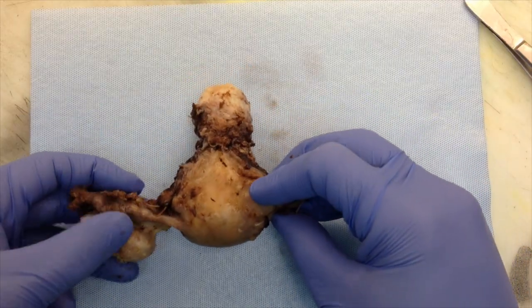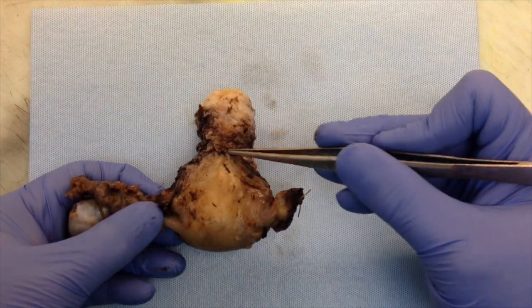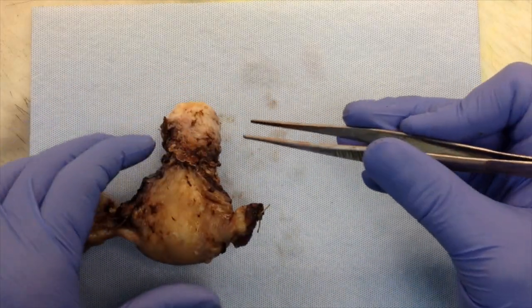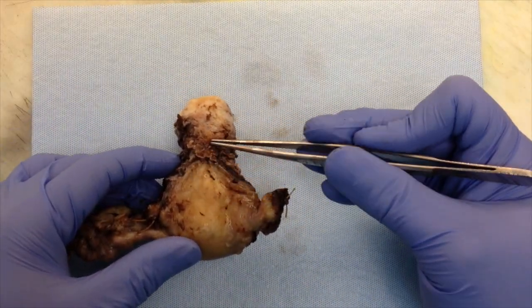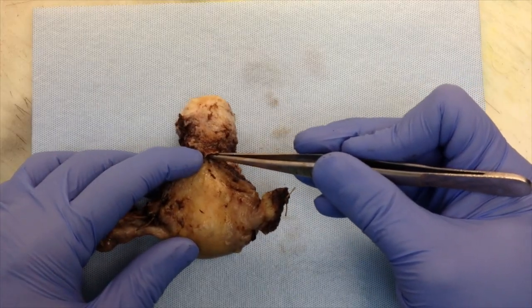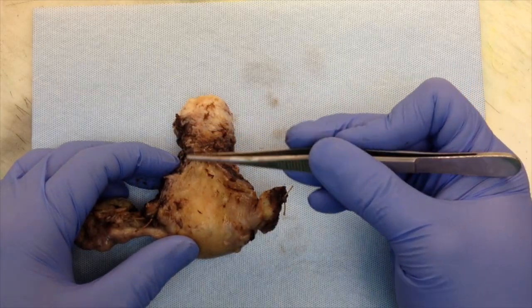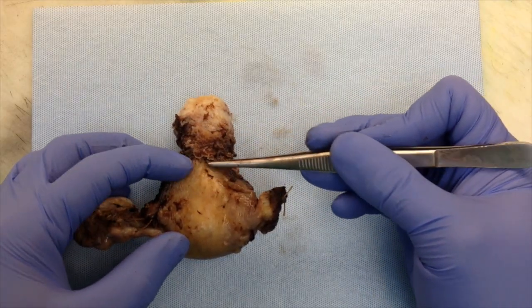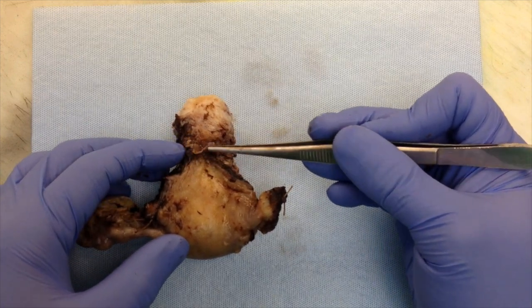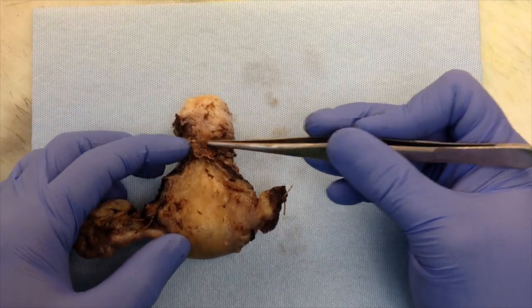The second way is if you don't receive the ovary and tube. So this is anterior. Sometimes it's difficult to tell, but in this case you can tell. In a lot of cases you can. So the peritoneal reflection on the anterior is going to stop much higher than it does on the posterior, because the bladder sits right above the uterus here, and so the surgeon needs to dissect the bladder away, and it leaves all this cauterized margin here.